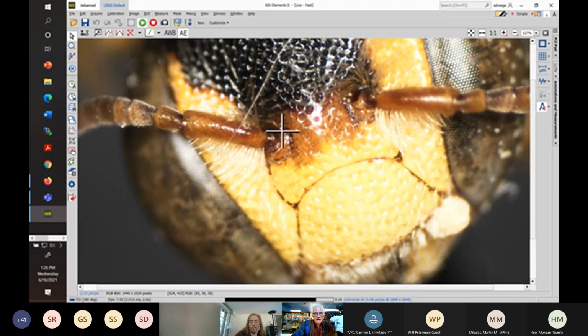All right. Antennae. This is the scape. This is the fossa. This thing down here probably has a name, but I never use it. Here, very clearly in this particular case, remember how hard, next to impossible, really, in Andrena it was, because they were dark-skinned, or dark integument. This has very light integument, and there's the suture lines here. Here's the clypeus. These are pits. I think these are called tentorial pits.